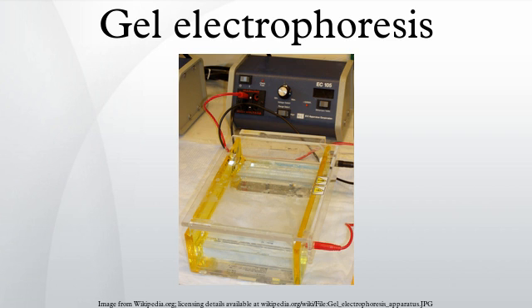Physical basis. In simple terms, electrophoresis is a process which enables the sorting of molecules based on size. Using an electric field, molecules can be made to move through a gel made of agar or polyacrylamide. The electric field consists of a negative charge at one end which pushes the molecules through the gel, and a positive charge at the other end that pulls the molecules through the gel. The molecules being sorted are dispensed into a well in the gel material.